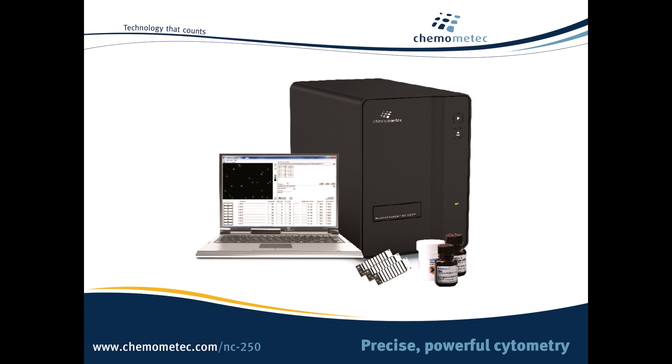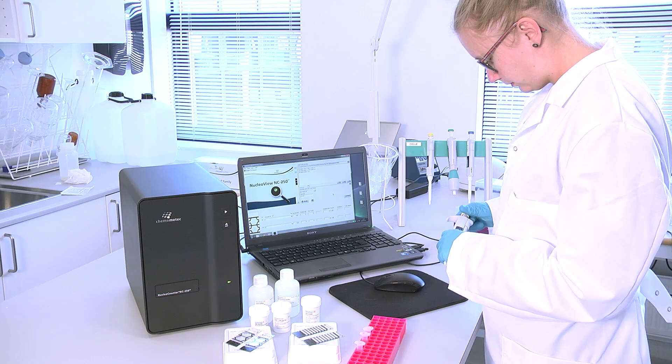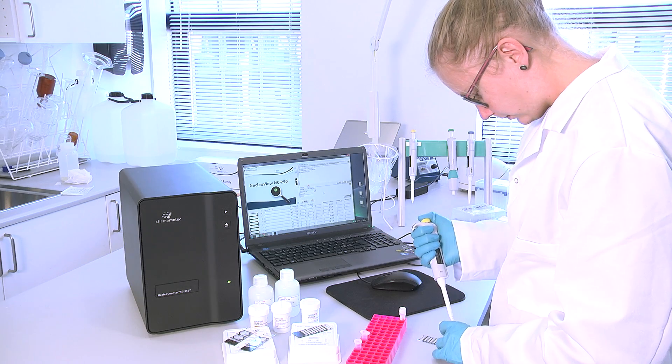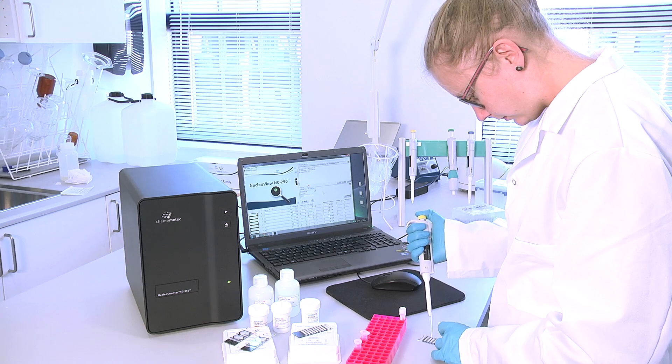The Nuclear Counter NC250 offers powerful, precise cell counting and more. You can perform up to 8 precision cell counts in less than 3 minutes.